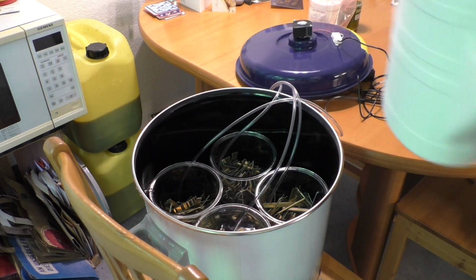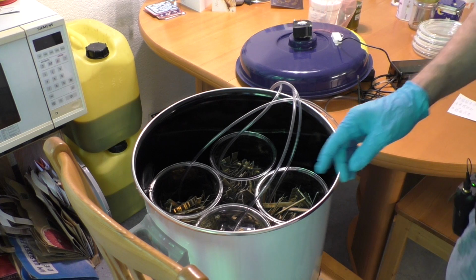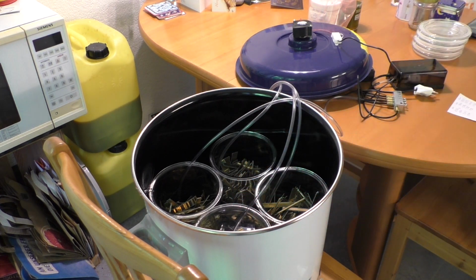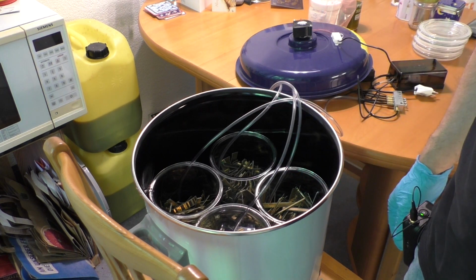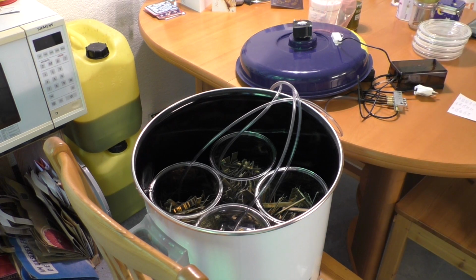Okay, that's about 5 liters of water and it seems that's just right. Yeah, you may have noticed that I spilled some water into the glass, so that's not a problem because the iron chloride is already a water solution, so a little bit more water, some drops, doesn't count. Okay, let's add the chemical.